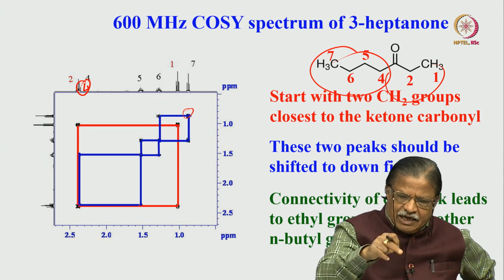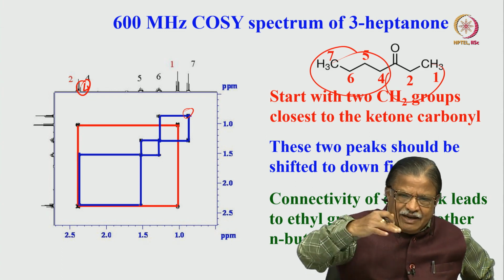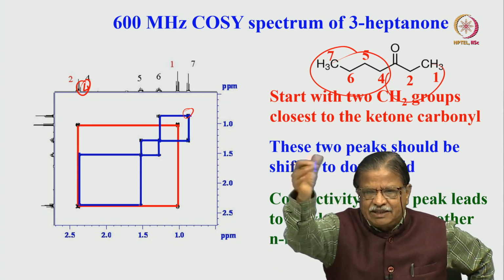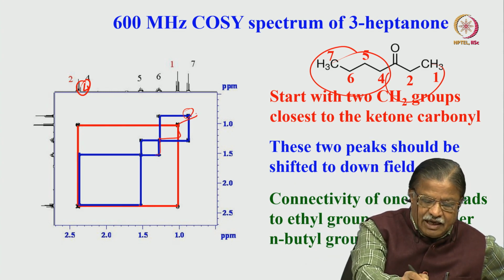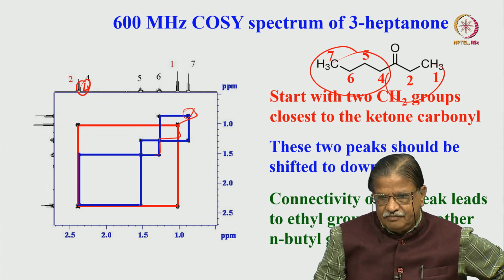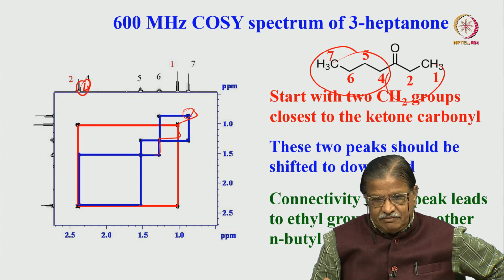From that diagonal, you can continue like this further. See whether there is one more square, and then from the other one. So you can keep on extending like a ladder, one after the other, like here. Start with this, go here, here, like this. Keep going one by one. And then complete assignment of all the coupled partners can be made.